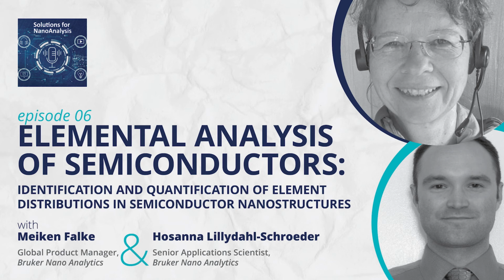Yeah. Just to repeat, I already mentioned the 3-5 mixtures, which are really difficult for EELS, mixtures of many elements, and finding residuals of manufacturing preparation. Also the gallium and platinum from the FIB can be seen in EDS, by the way. Particularly challenging are perceived the overlaps of, for instance, hafnium, tungsten and silicon, or the overlap of copper and tantalum.